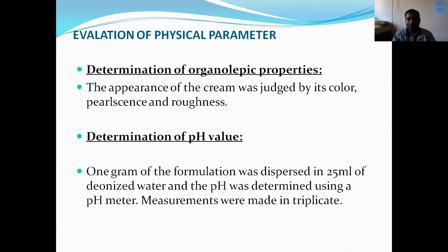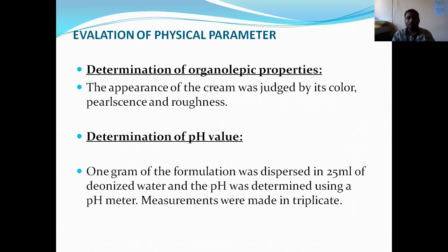We are discussing the evaluation of physical parameters. The first one is the determination of organoleptic properties. The appearance of the creams was assessed by its odor, color, pearlescence and texture. So the appearance of the cream was determined by the color, pearlescence, and texture.